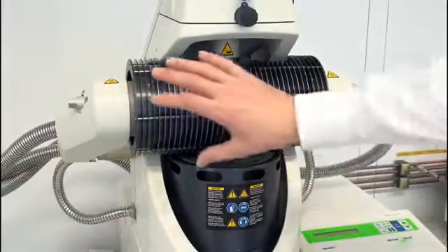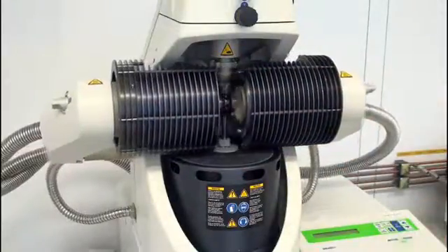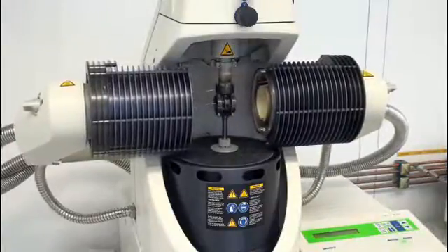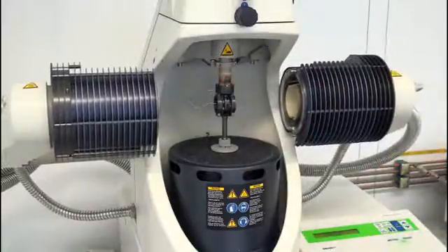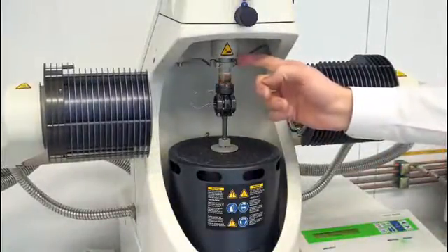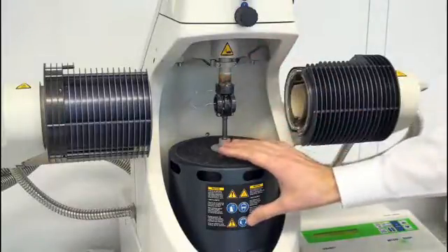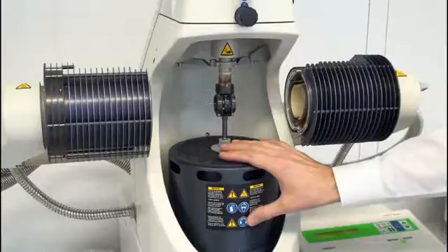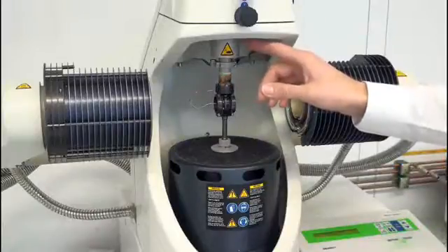But before we start with the actual preparation process itself, let's have a quick look at the instrument. This is the furnace and when we open it, you see the clamping assembly. Up here we have the sensors to measure the force and the displacement. Down here is the motor to generate the force. You see the force generation and the force measurement are independent.